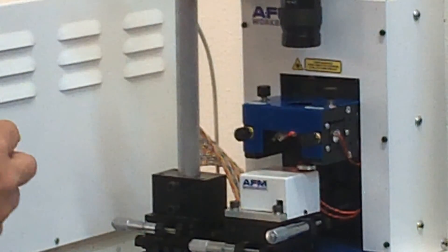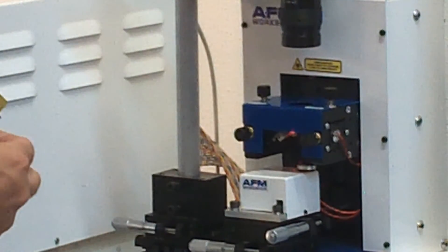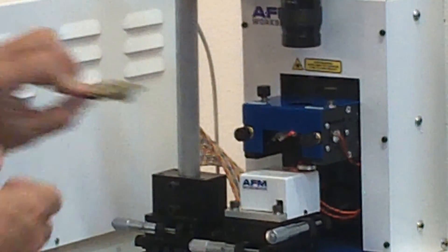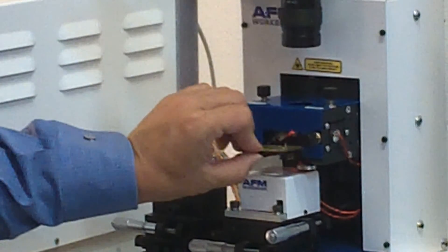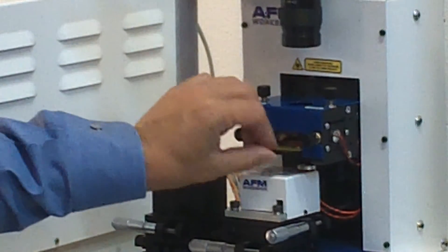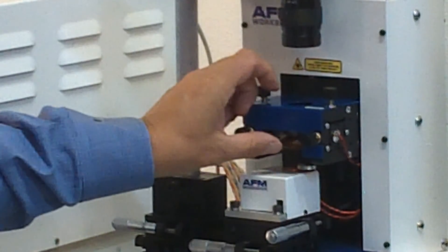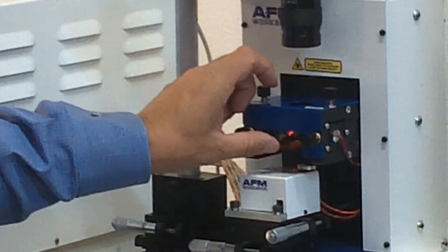The next step is to introduce the cantilever into the microscope on the cantilever cassette shown here.